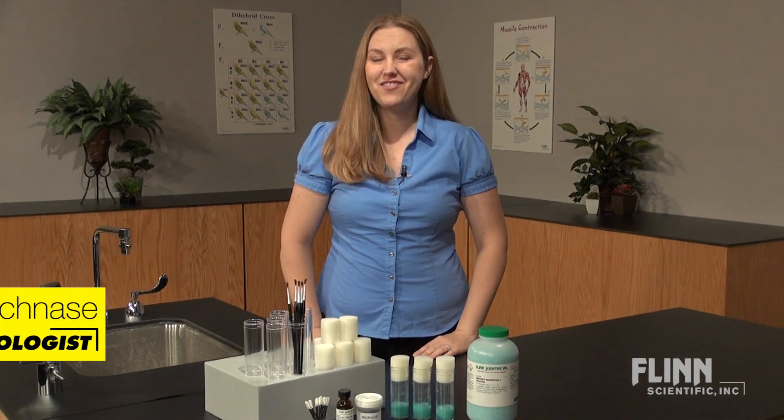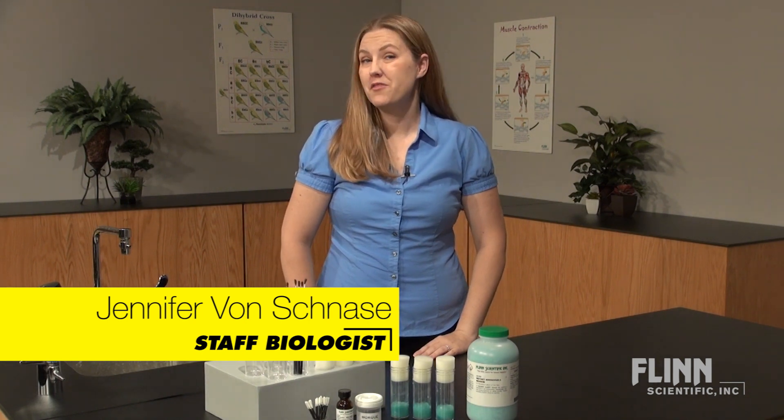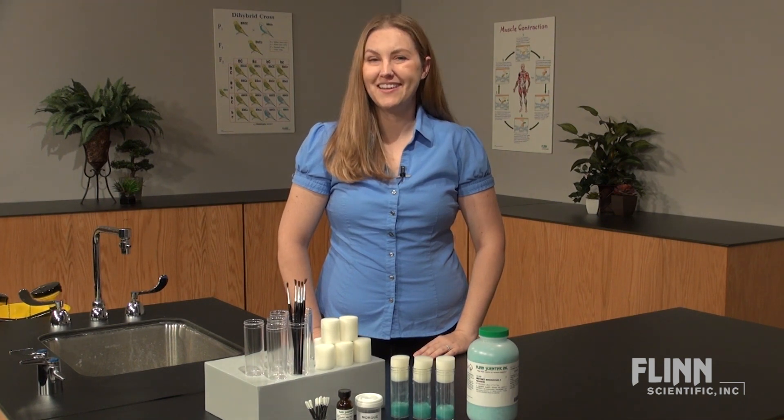Flinn Scientific carries everything you need to perform successful drosophila experiments. Whether performing a monohybrid cross, dihybrid cross, backcross, or sex-linked cross, we carry the cultures and supplies.